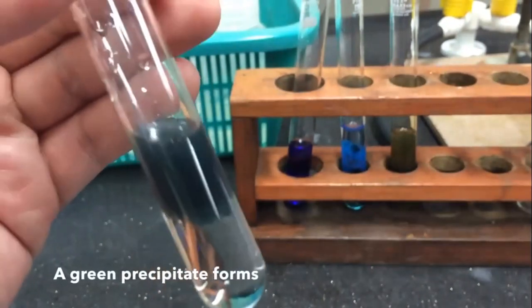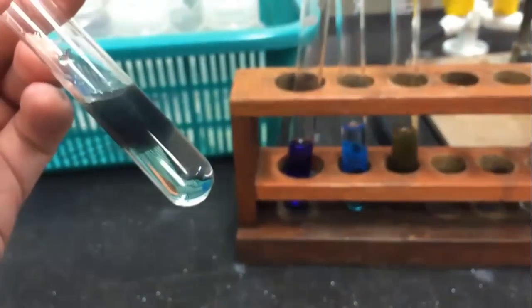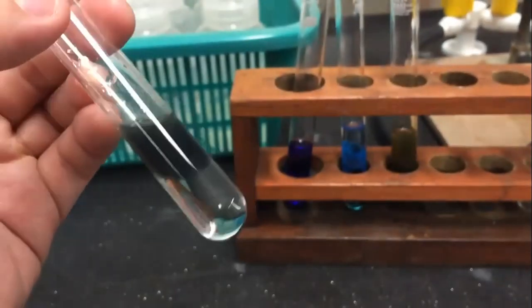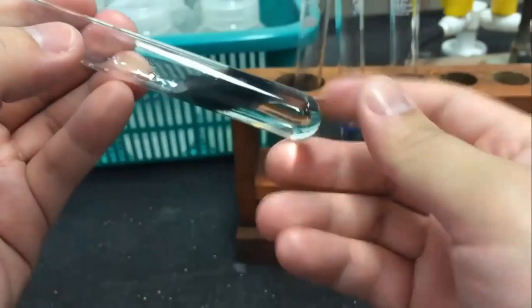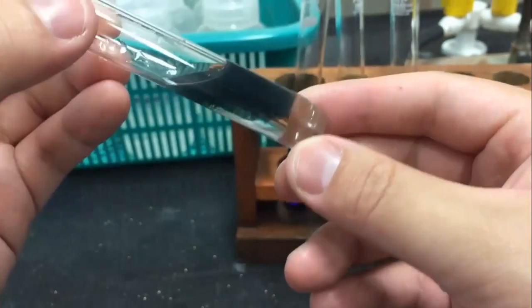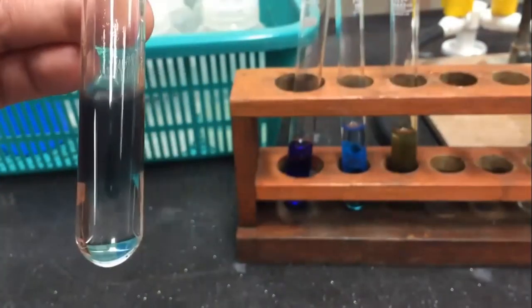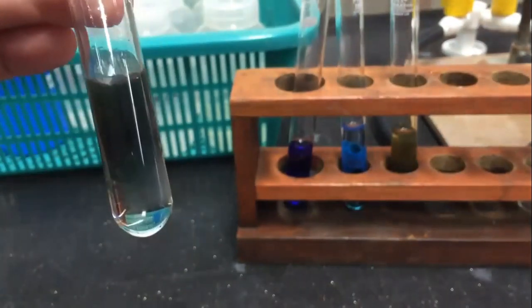Notice that a green precipitate forms. Shaking the test tube may sometimes give a false impression that the green precipitate dissolves in solution.